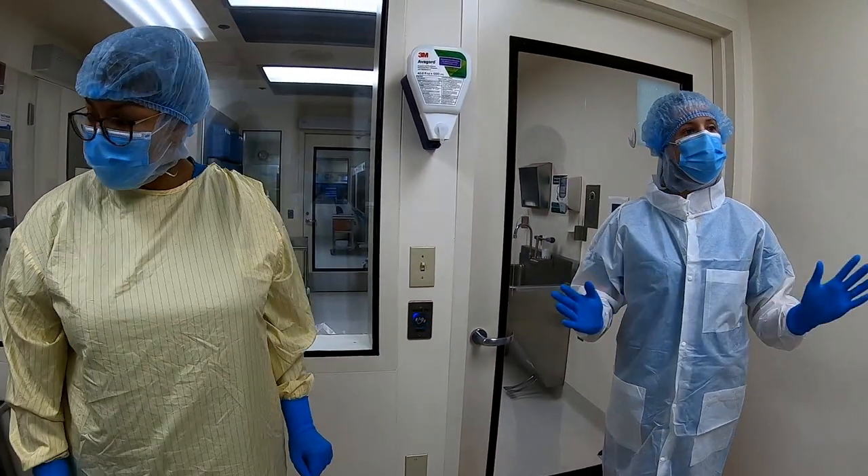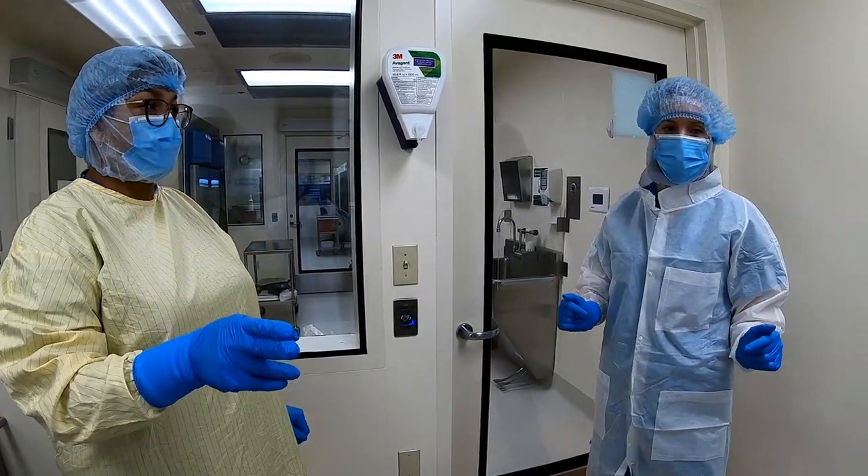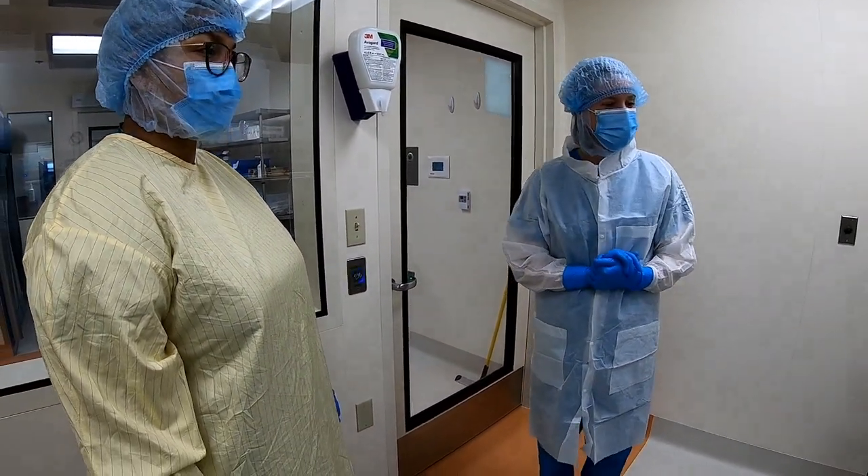Question: are there going to be sharps containers inside the hoods? Yes — little sharps containers for the hoods. Good question.